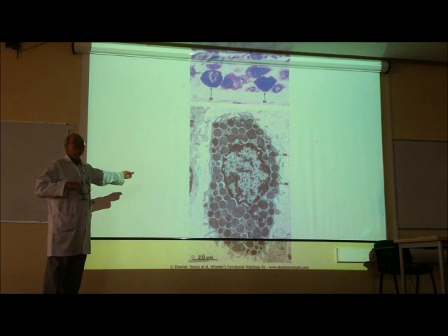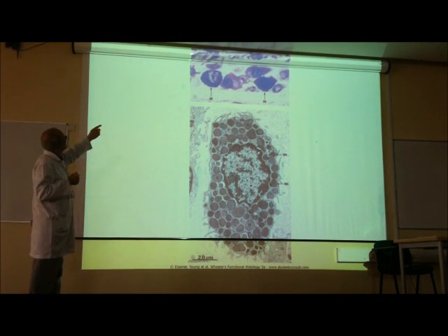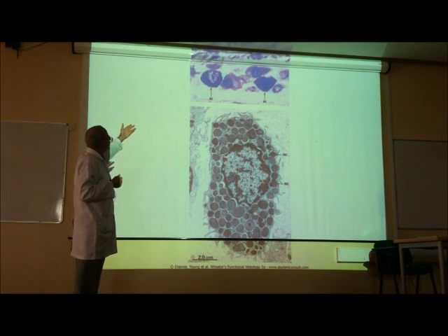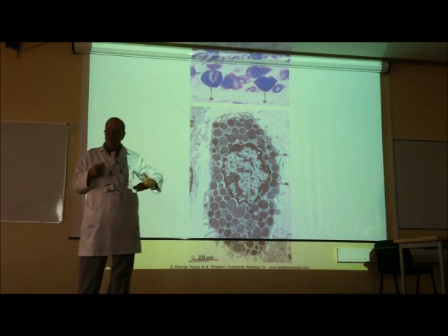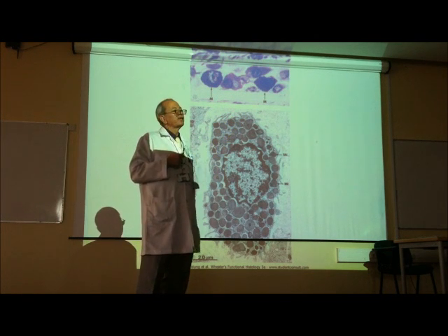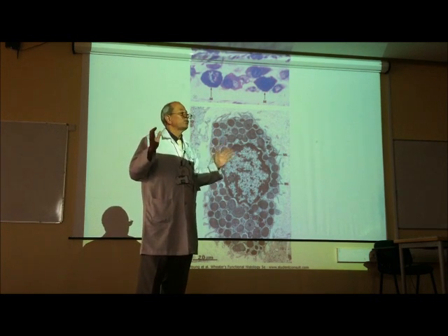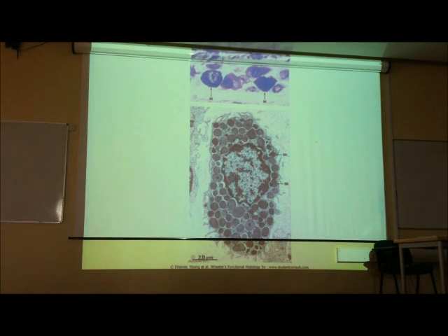Now you are sure that the previous one was wrong? Okay. So, what's the type of this cell? It's a mast cell, full of secretory granules. The nucleus is central and the shape is oval. Concentrated around the blood vessels in connective tissue. Formed by bone marrow and travels to the connective tissue. Okay? This is all about the mast cell, in addition to its secretion, which is mainly heparin and histamine. There are others.